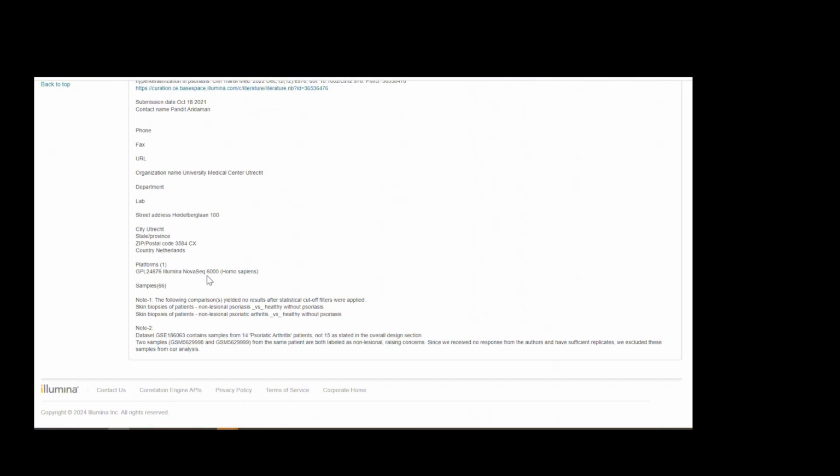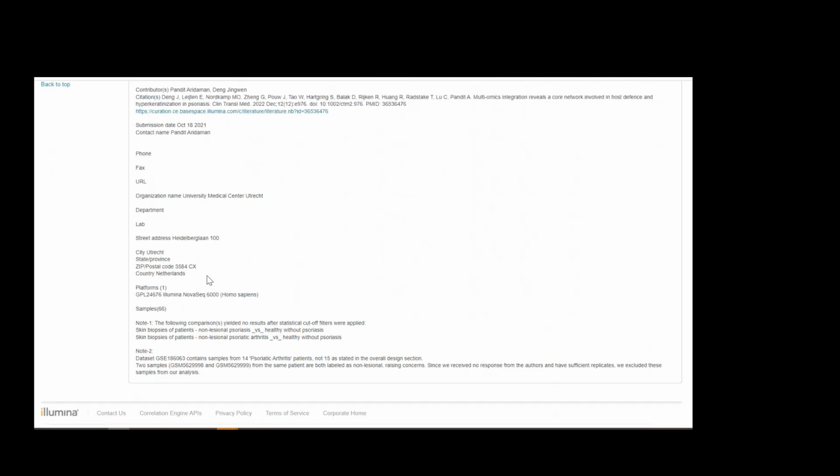Curators give studies an easy-to-understand name, carry over and annotate source descriptions, compute test versus control comparisons, document quality control metrics, and post signatures based on the available sample varieties within the study.